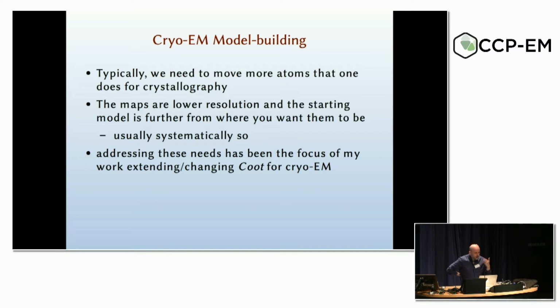Not every part of what I've been doing is visible at the GUI, and we'll talk about that. I will talk about 4 things, perhaps less now. Jiggling, morphing, restraining, and refining.